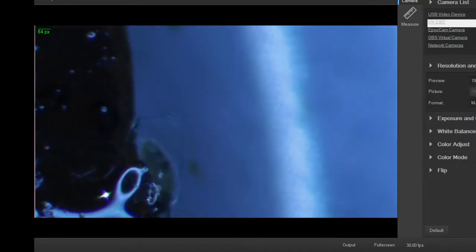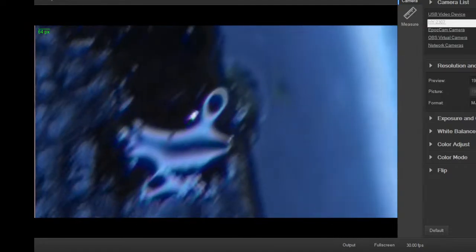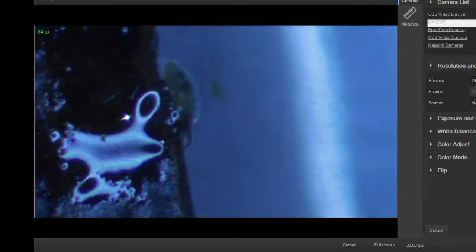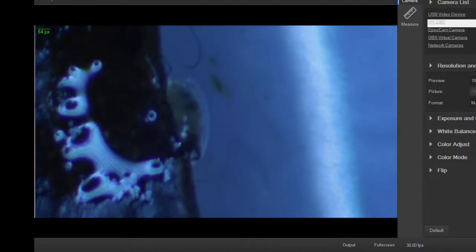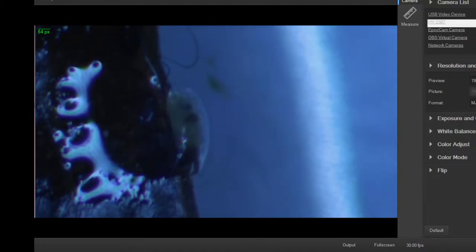Slowing it down for sure. I wouldn't want this crawling around and getting onto me and trying to bite me. Although, as long as you grab them before they actually burrow the head in, it's not so bad. It's just a pain with this once they bite you.